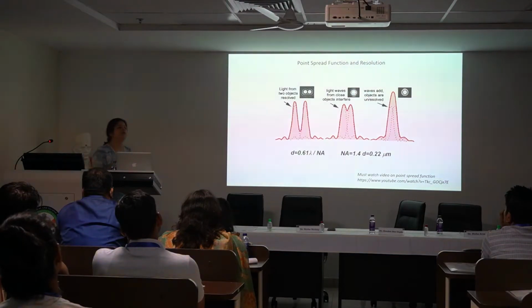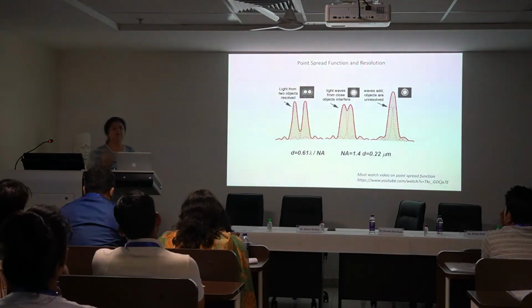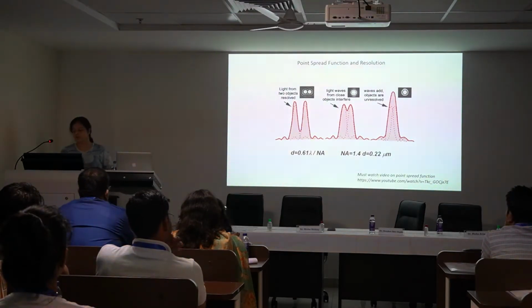So if we are looking for, let's say, the placement of a couple of different particles in a particular region of the cell, for example the endoplasmic reticulum, and we have two or three different kinds of proteins present there, then they are basically going to appear to be in the same general space. But which set of molecules are close to each other is not something we can decipher using this kind of microscopy.